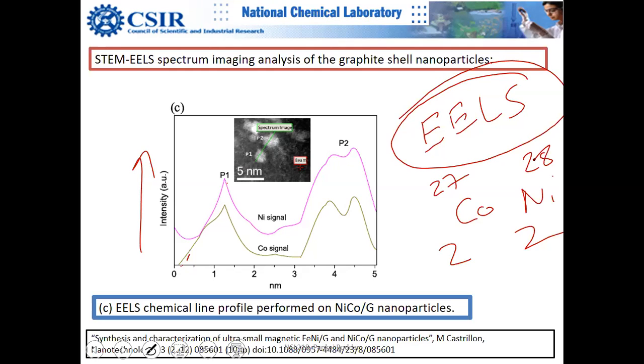That is the beauty of neutron diffraction, neutron scattering. That's why people rush to the neutron facilities, because this problem cannot be resolved by anything. Please note that. It is a very serious problem, what you see in the data. This can be done only by EELS. EELS can do that.